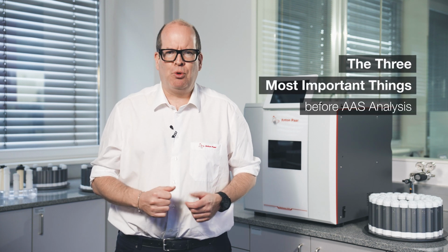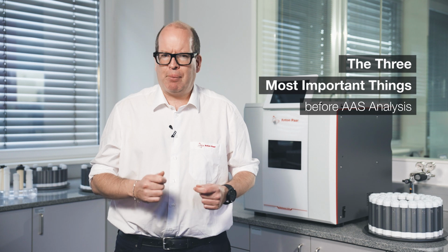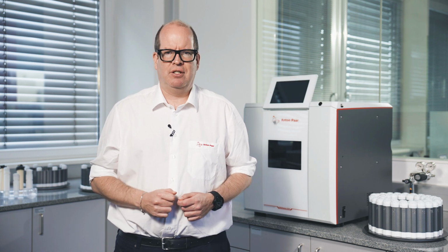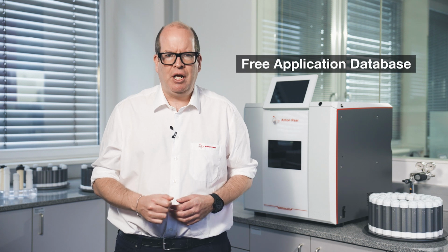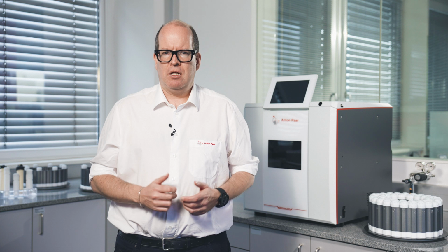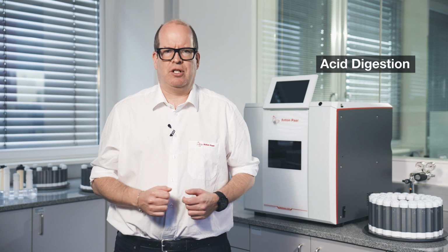In this video, you'll find out what the three most important things are that you need for successful sample preparation prior to AAS analysis. You'll also get a link to a valuable database for preparation of individual samples. First off, which sample preparation technique is actually used? There are different methods of sample preparation. Today, though, we're going to focus on the most important and commonly used one, acid digestion.